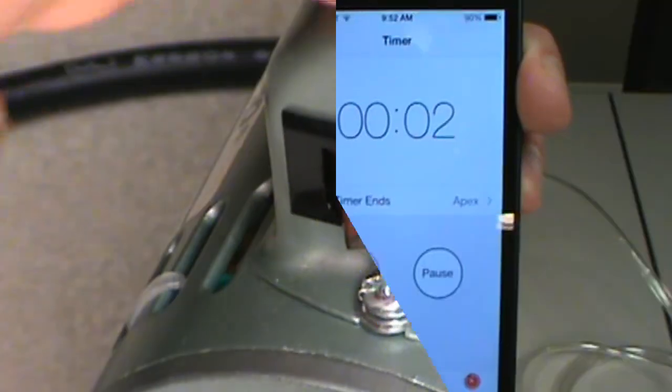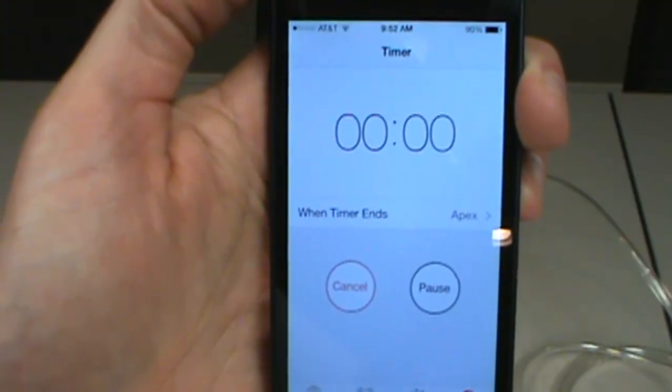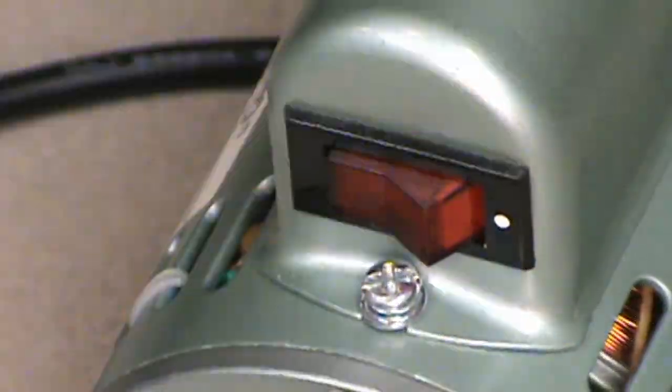Set your timer to two minutes, start it, and switch on your vacuum pump. Once time is up, turn off the pump and remove the cartridge from the hose. Remember to replace the caps on both the top and back of the cartridge.